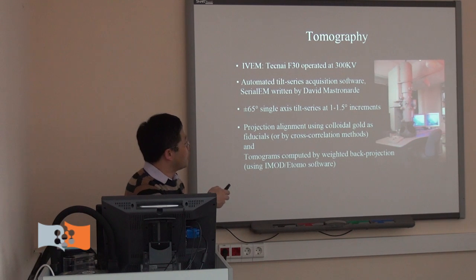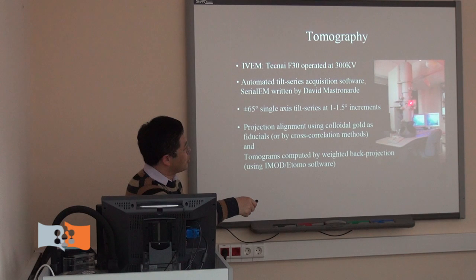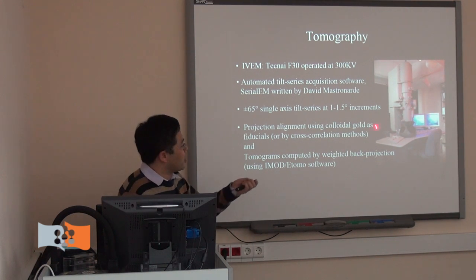So in practice, we insert the sample here, and this sample stage can be tilted, computer-controlled, because we have very high magnification of the EM field.